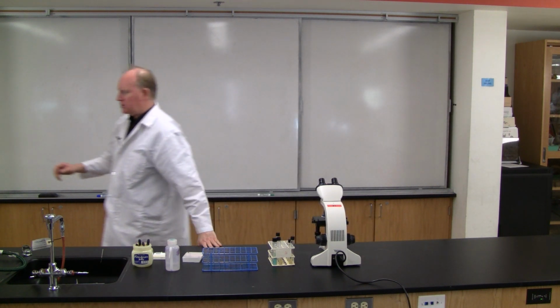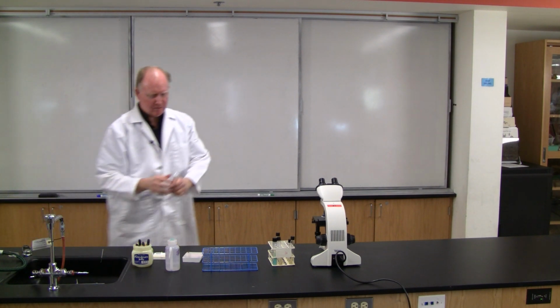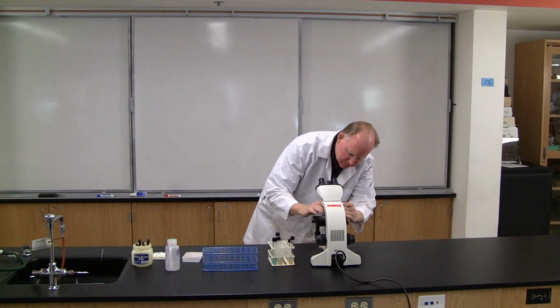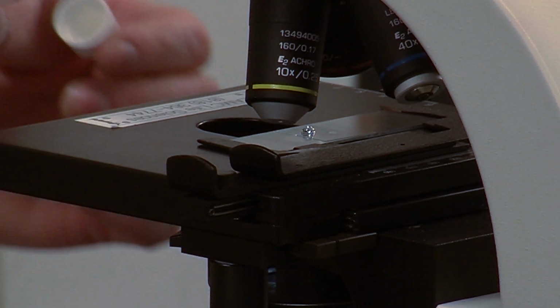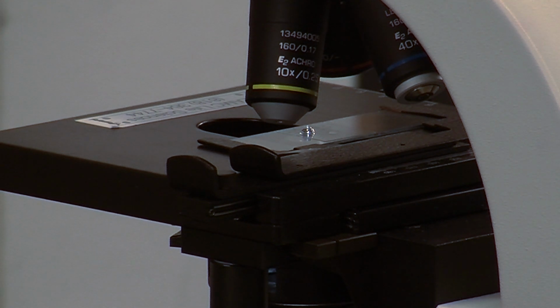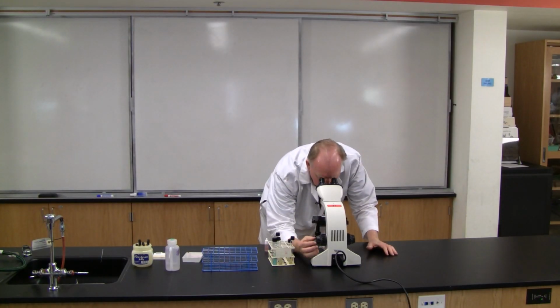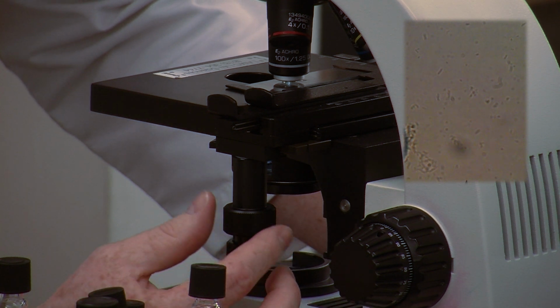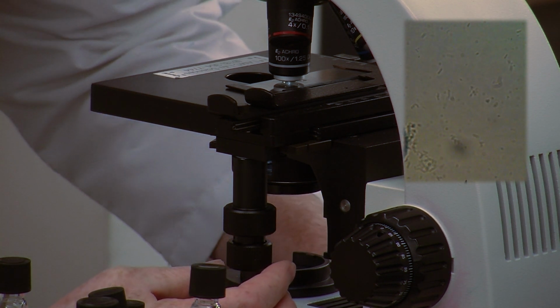So I'm going to turn off the Bunsen burner. Don't need that. Place a small drop of immersion oil on top of the cover slip. And go straight to oil immersion. And adjusting the fine focus again, finding the edge of the bubble, getting that in focus, and boom, there are the bacteria, and you can see some very motile E. coli.